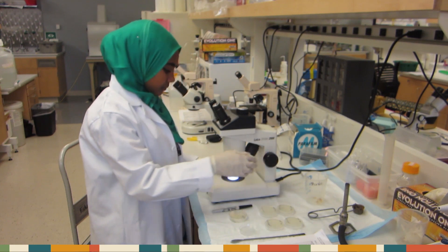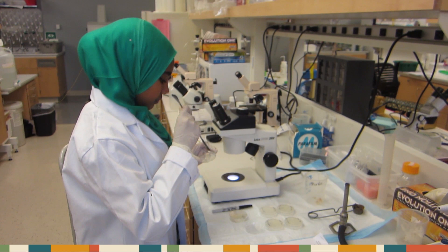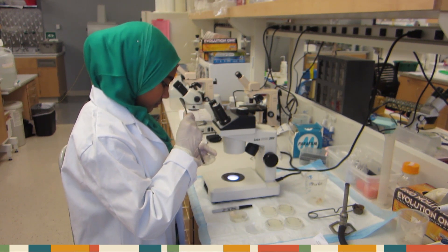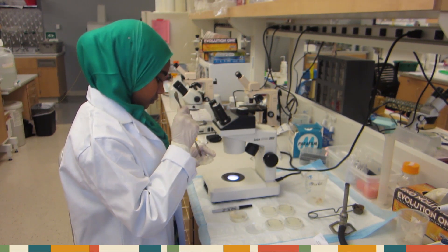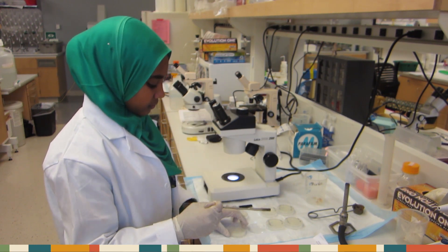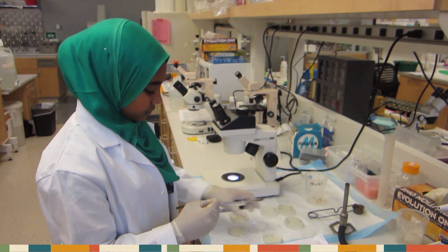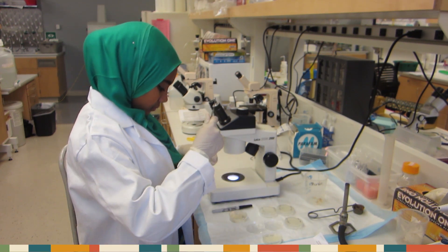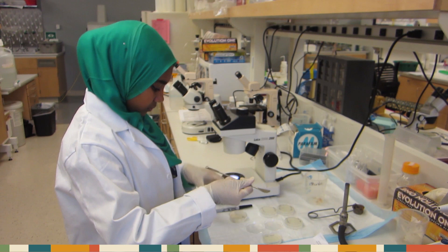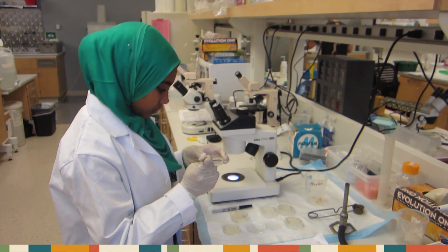Using your sterilized spatula, cut a rectangle around that region. Then, divide it into two pieces. Scoop up one of those pieces, and place it worm-side down on your empty low-salt plate. Remember to put it around the rim.